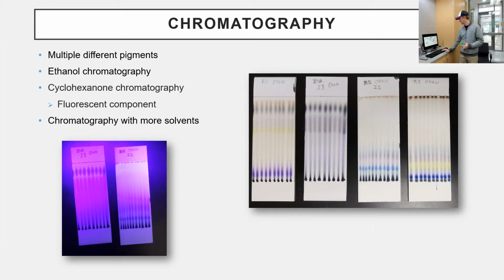So that's the chromatography. I did a little chromatography. That's just beautiful. It looks pretty cool. Yeah. I did one with industrial Sharpie and then just a regular Sharpie. The two in the middle are industrial Sharpie. The two in the middle of what? In the four panel. So the two in the middle of the four-panel one are industrial Sharpie. The two on the outside are regular Sharpie.